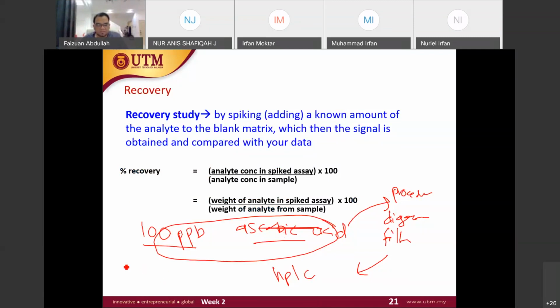We analyze, and if we get 80 ppb, is it acceptable? Yes, acceptable.